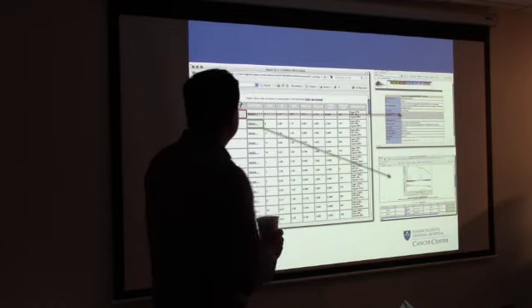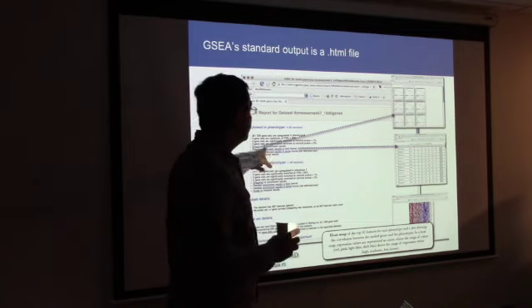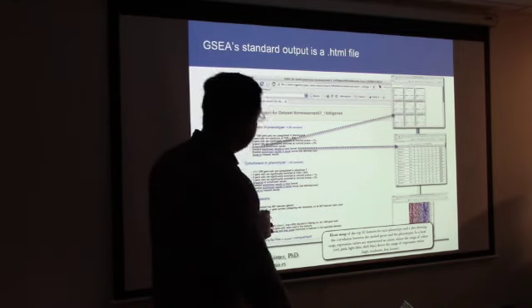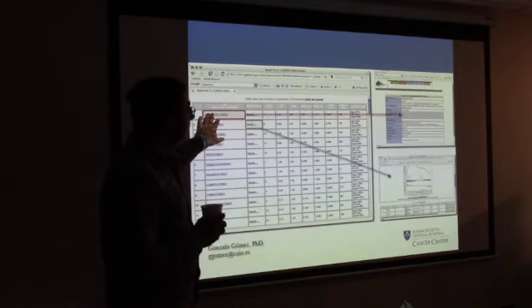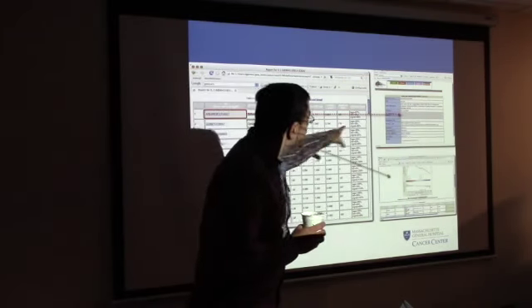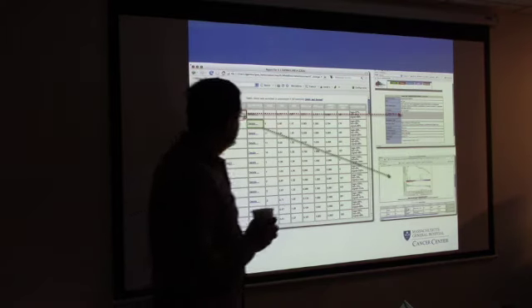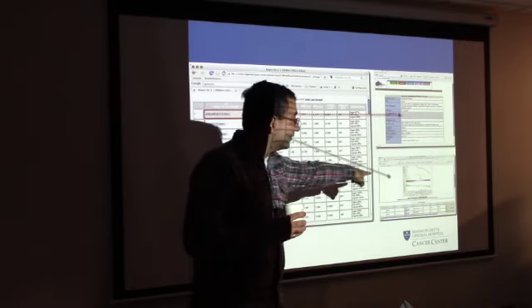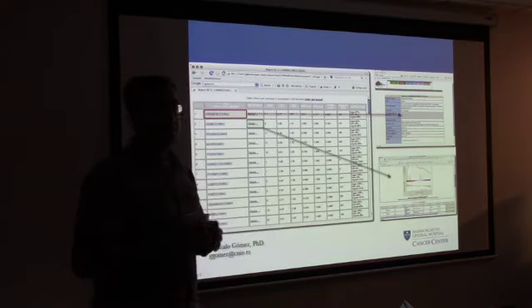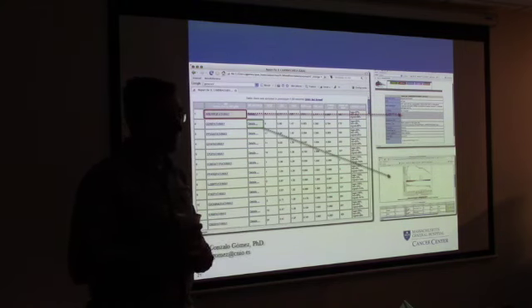So for example, let's say we went over this link for the enrichment results in HTML format, then this shows up. You can click on that, and then it gives you further details about the pathway itself. If you click this details for that pathway, it shows you your actual figure, which is the enrichment graph. That's the one you want to put in your slide or in your presentation. Okay.